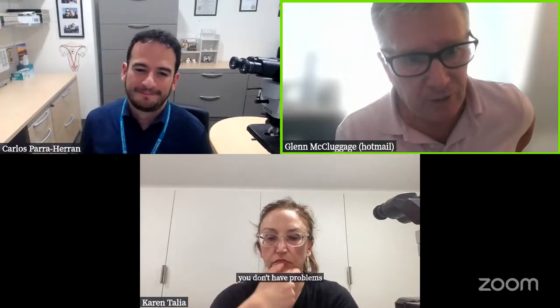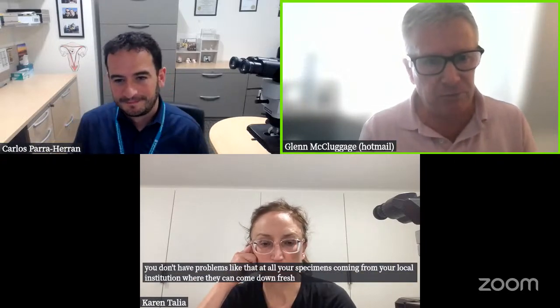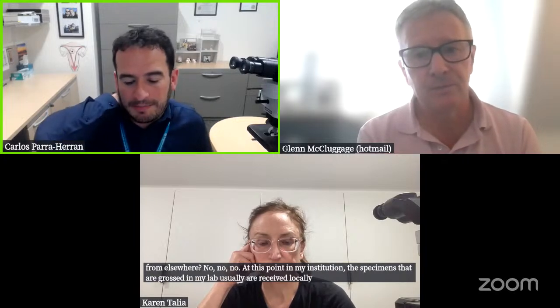Are all your specimens coming from your local institution where they can come down fresh? You don't get hysterectomy specimens from elsewhere? From elsewhere, no. At this point in my institution, the specimens that are grossed in my lab usually are received locally, meaning they make it straight from the OR.